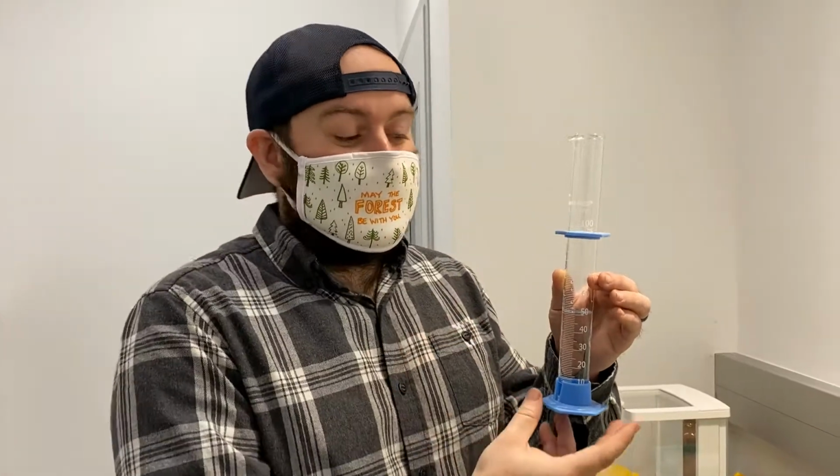Now I need to measure out the volume in my graduated cylinder. So I've pre-filled this graduated cylinder with about 50 milliliters of water. And in the experiment procedure, it says 20 to 30. That would be fine if we were doing it in the lab, but for the video's sake, we had to add a little bit more so you could see it better.